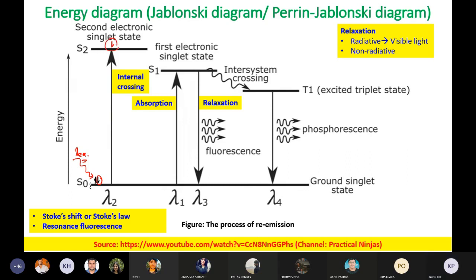But the spin of the electron is not changed.